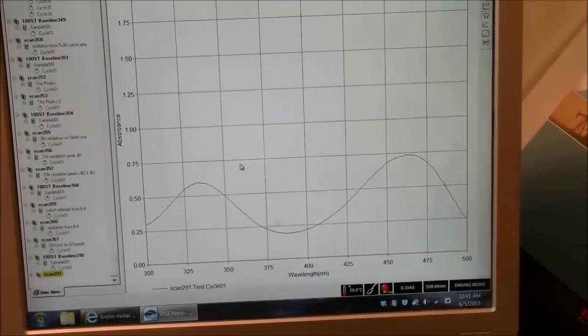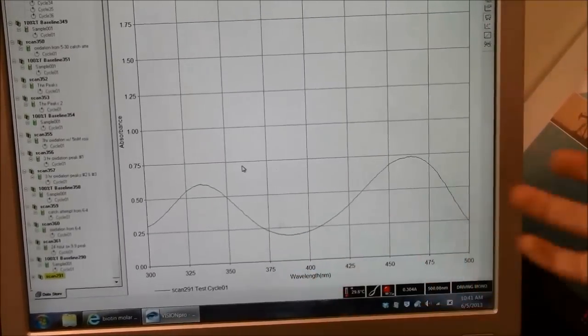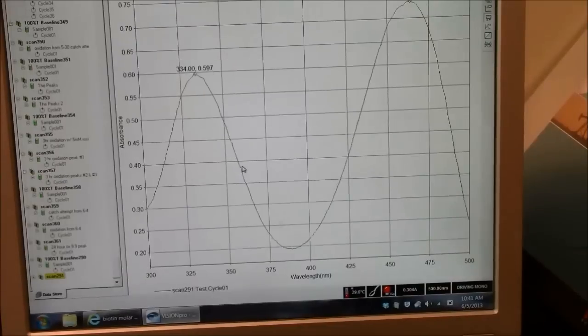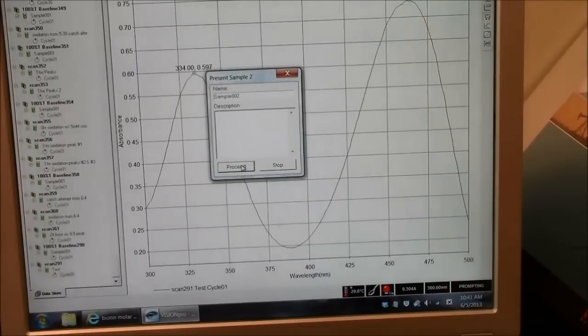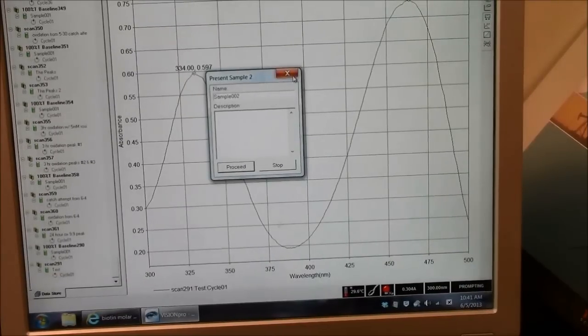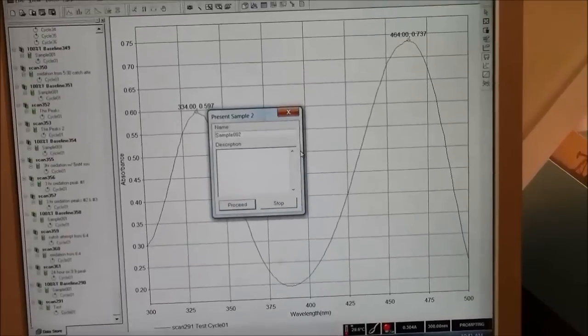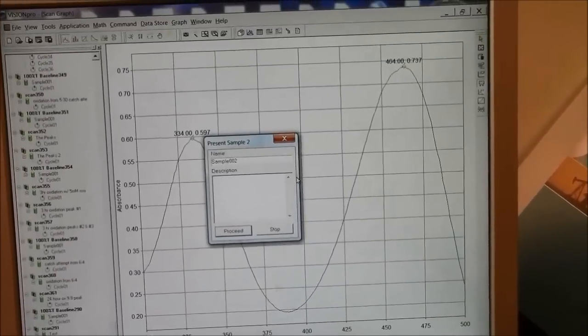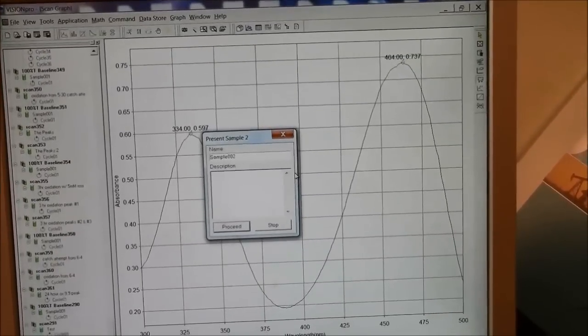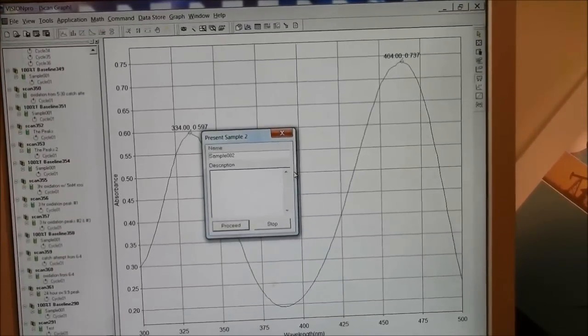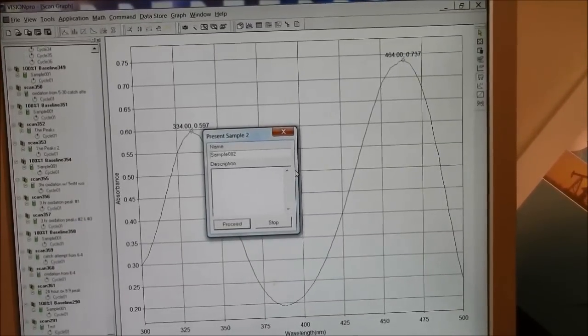In this case, I got twin peaks. Sometimes you get one peak. Sometimes you get two. Sometimes you get 15. It depends on the type of molecule you have and whether you have a pure sample or a mixture.